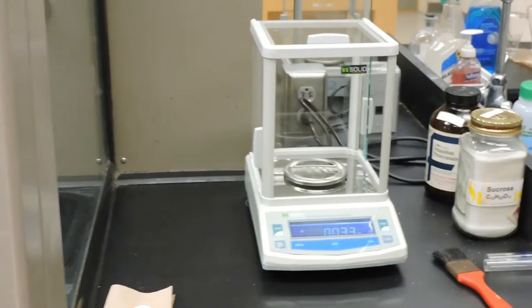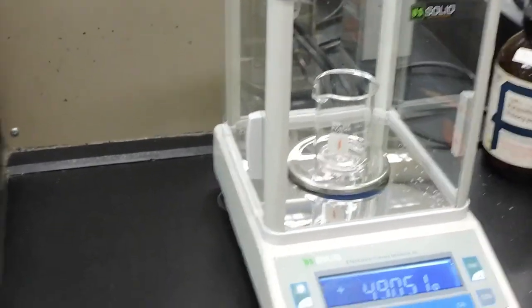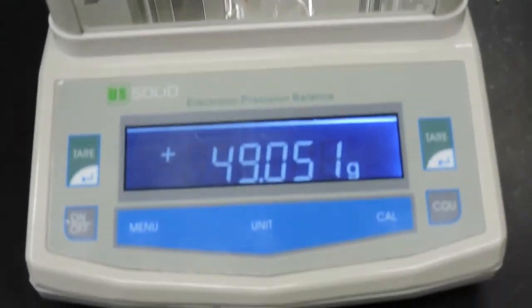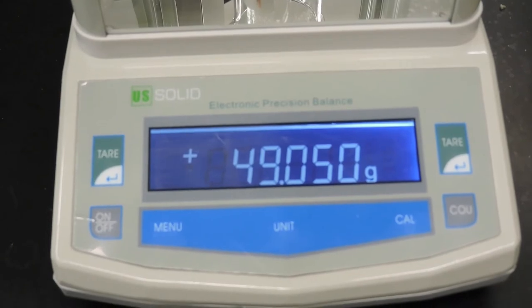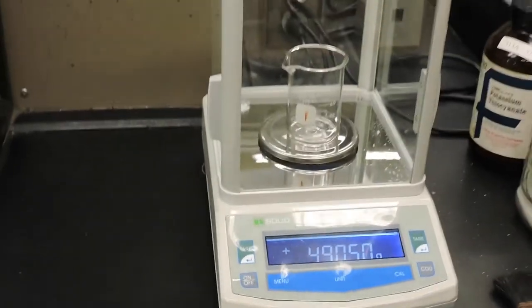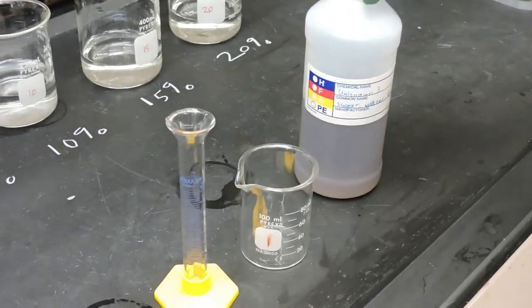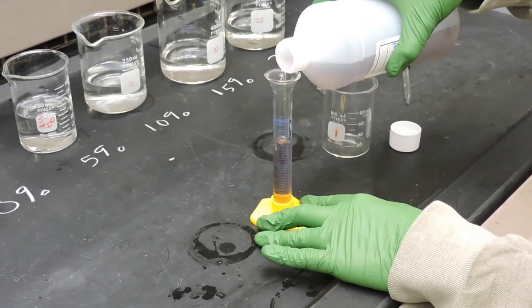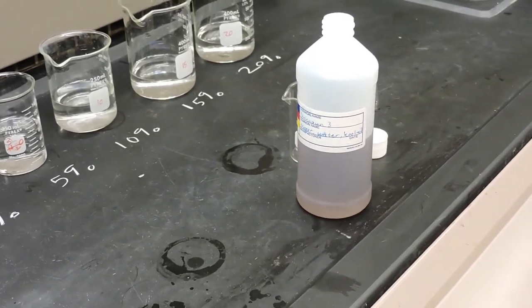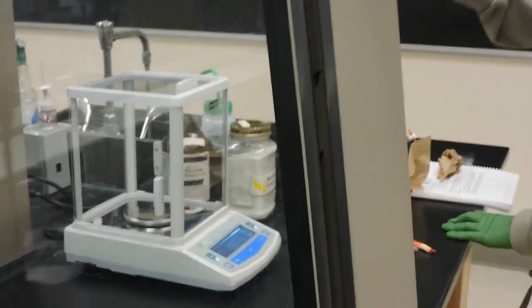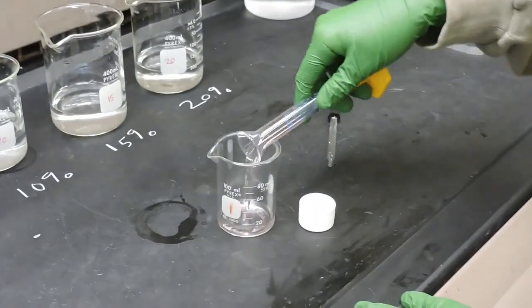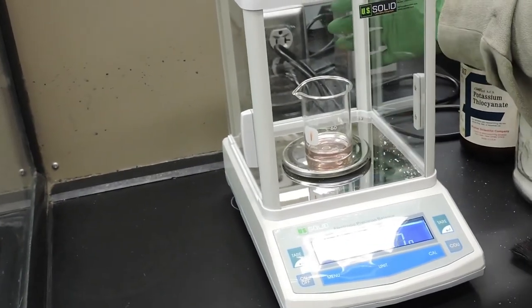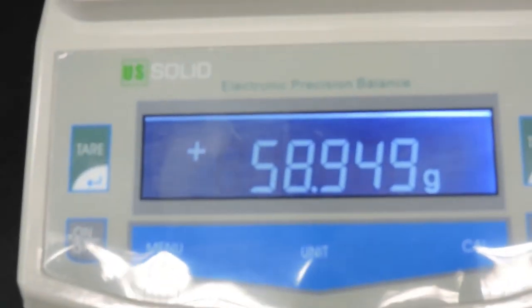The final soft drink is the unknown solution. So we'll find the mass of 10 milliliters by first pre-weighing the beaker again. The mass is 49.051 grams. And then we will add 10 milliliters of our unknown, unknown number three. Now with 10 milliliters of that unknown in the beaker, we'll find its mass again. And that is 58.949 grams.